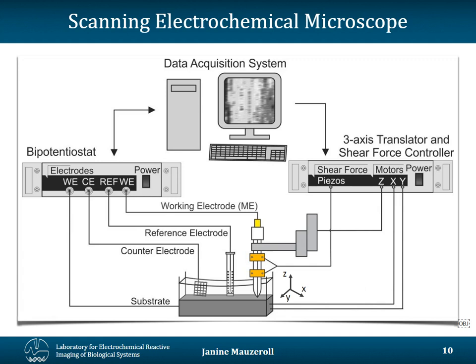By rastering that microelectrode across the surface using high positioning motors. Now, in some systems, you can also have additional distance controllers, like a shear force controller, for example, that consistently monitors the tip-to-substrate distance if your objective is to perform a measurement at a constant distance. And there are several different types of ways by which you can keep a constant distance. Many people are actually professionals at building their own instruments. So I'm just trying to provide you with one example of how an SECM microscope works.